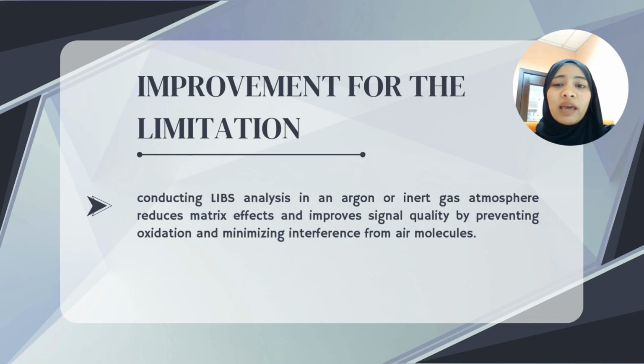Additionally, conducting LIBS analysis in an argon or inert gas atmosphere reduces matrix effects and improves signal quality by preventing oxidation and minimizing interference from air molecules.